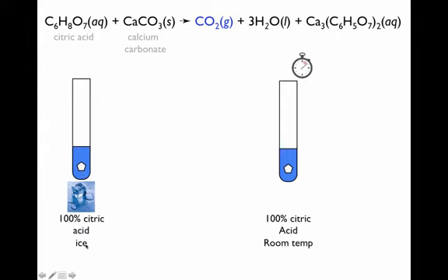on ice. And because it's placed on ice, because temperature affects the rate of a chemical reaction, the amount of time that it takes to produce all the bubbles should be substantially longer than it took over here with this tube. So this reaction should take place more slowly.